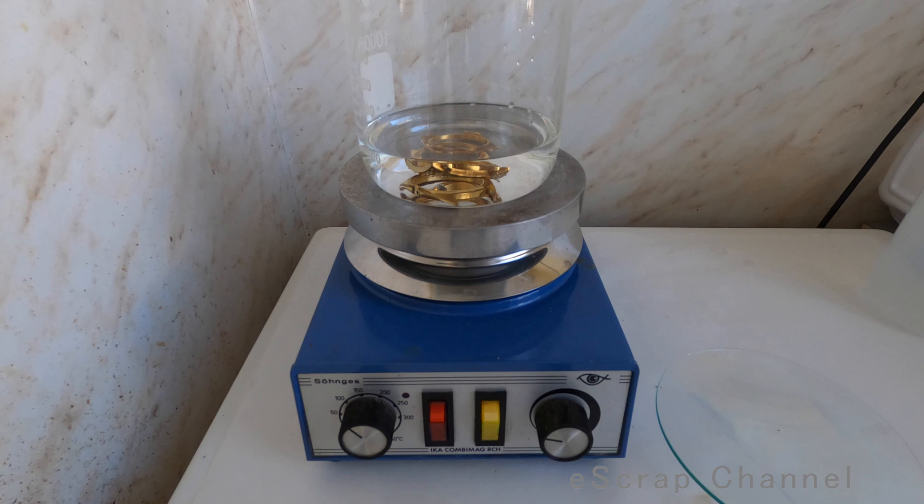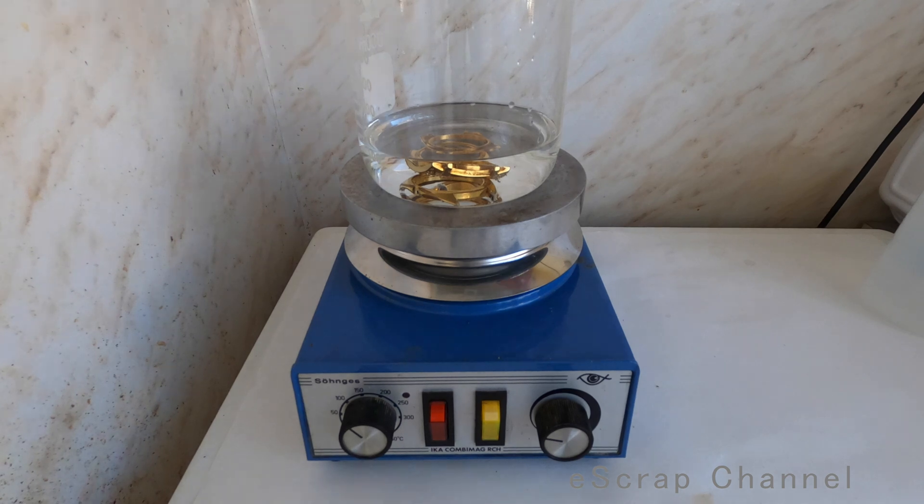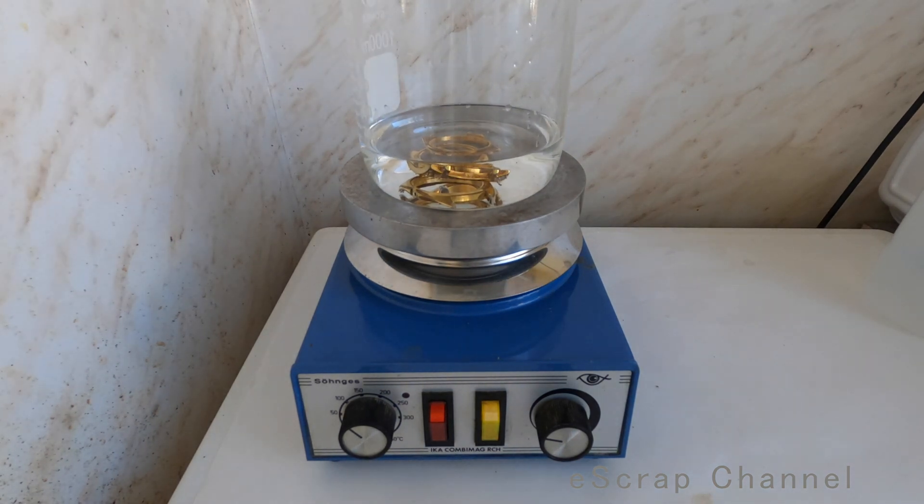Now what's going on inside? Nitric acid is searching for some defects on the surface of the watch cases to start dissolving the base metal. Let's put a glass watch glass on top and wait, because I expect this reaction from a certain point onwards to start going quickly.